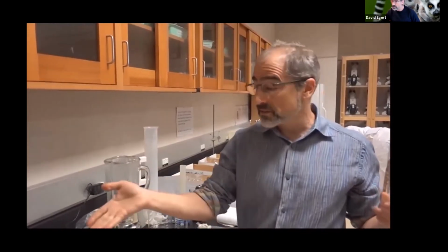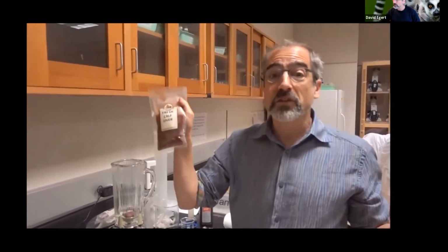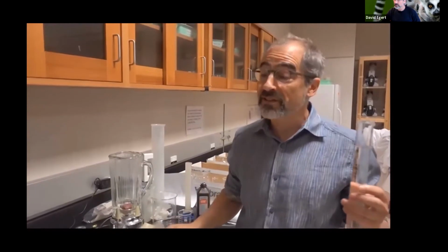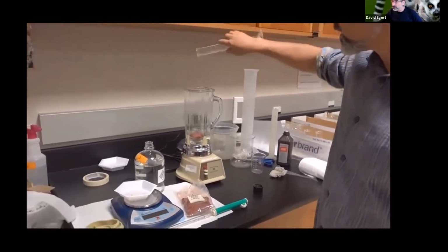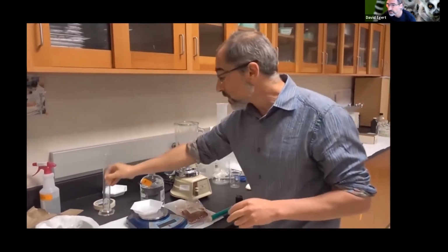Obviously, one is extremes of pH. This is an enzyme that's been optimized to work in a cow liver, which is somewhere around neutral, around pH 7, 7.4 or something probably. So here we have a pH 7 buffer. So it's going to help make sure it's an optimal environment so that our enzyme stays stable.